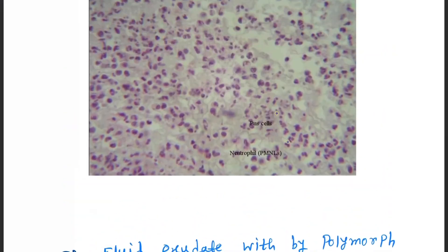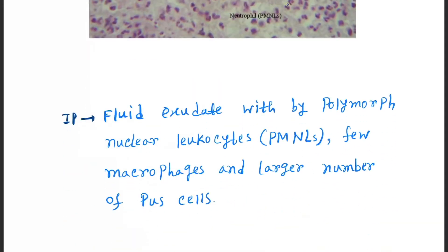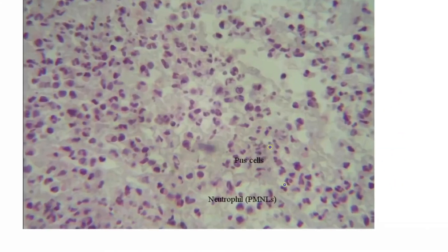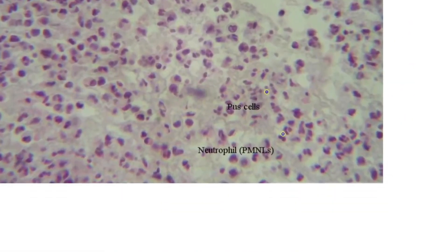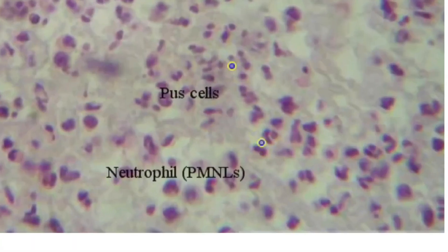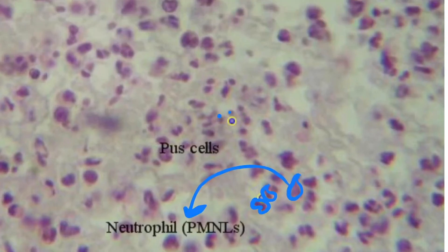The next image shows the polymorphonuclear leukocytes — PMNLs — and plasma cells. Here you can see the neutrophils, and these smaller cells are the plasma cells.